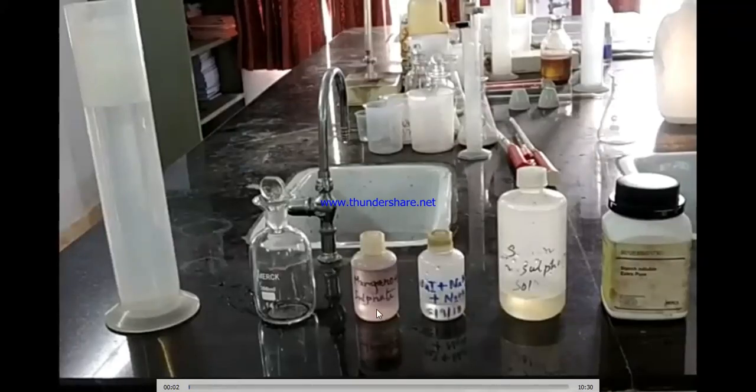This is manganese sulfate. This is alkali iodide azide. We will take 50 milliliter of water sample initially. We will do volume makeup up to 300. Then we will add 1 milliliter manganese sulfate and 1 milliliter of alkali iodide azide. Then we will mix it properly.